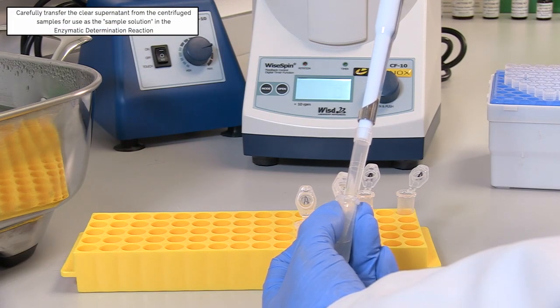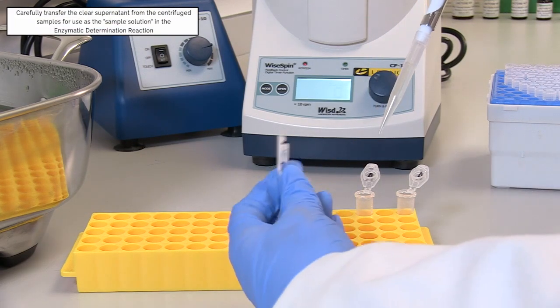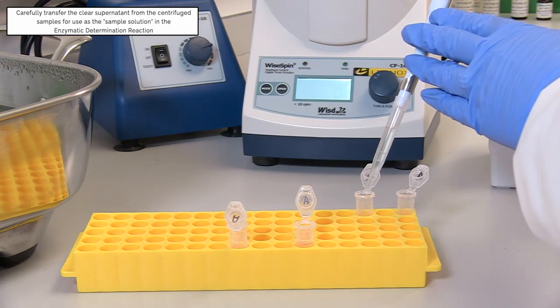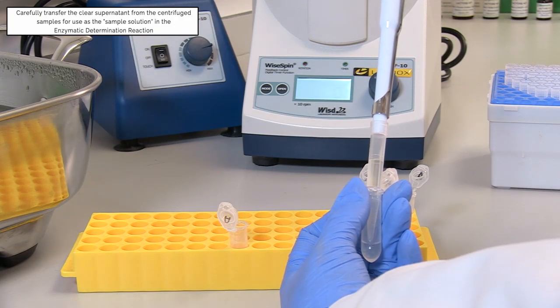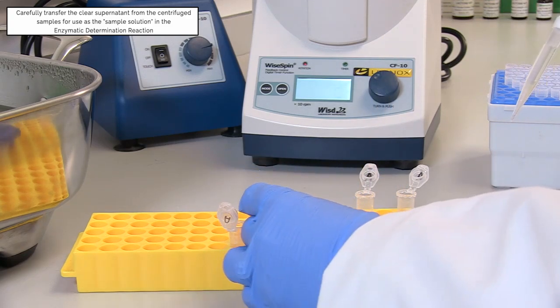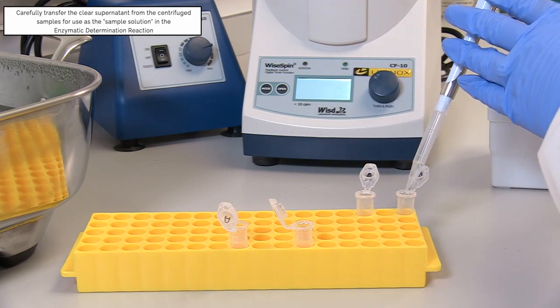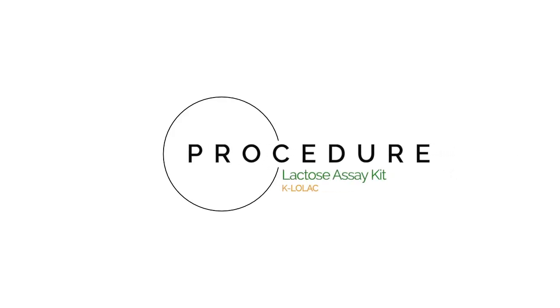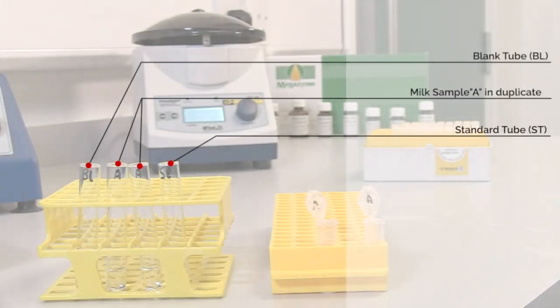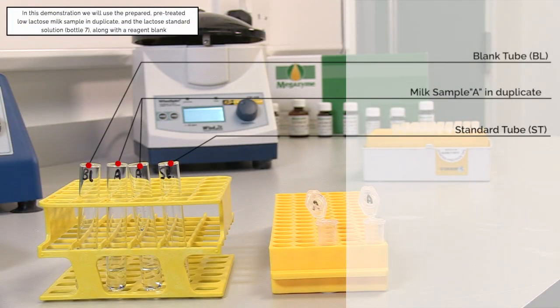Carefully transfer the clear supernatant from the centrifuge samples into clean, labelled microfuge tubes for use as the sample solution in the enzymatic determination reaction. In this demonstration, we will use the prepared, pre-treated, low-lactose milk sample in duplicate and the lactose standard solution, bottle 7, along with a reagent blank.